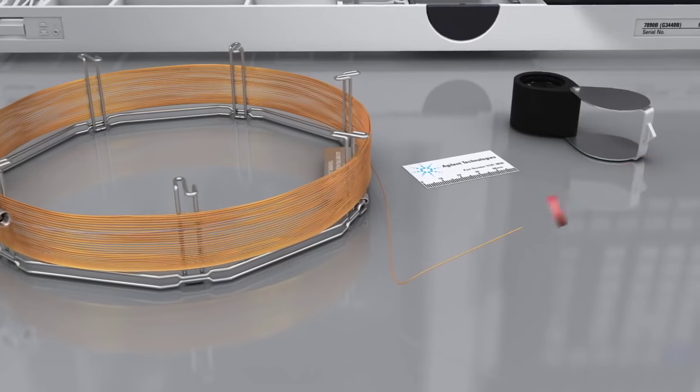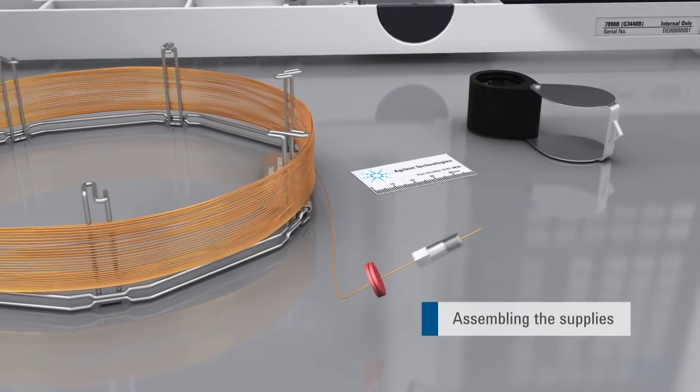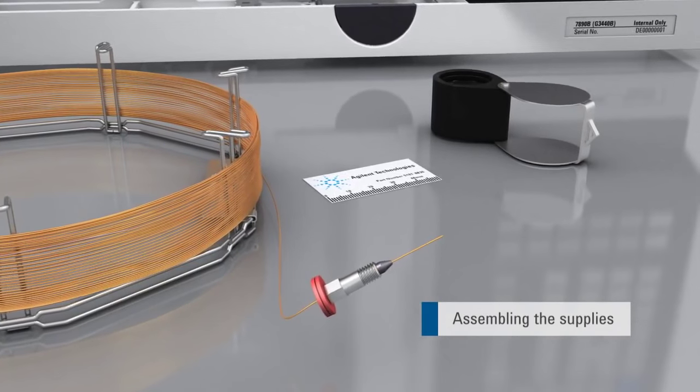Thread the column through an inlet septum and then through a column nut. Choose an appropriate column ferrule and thread column through it.